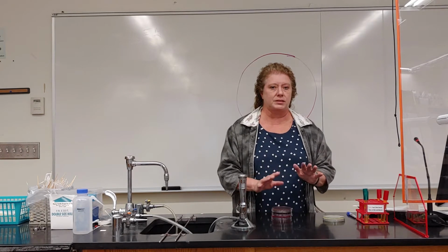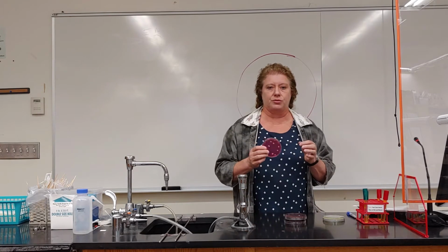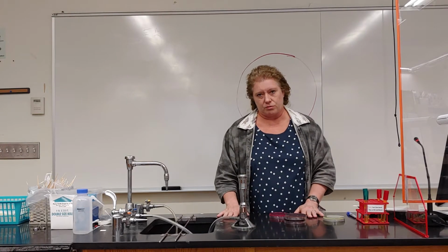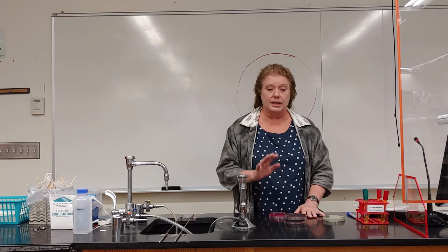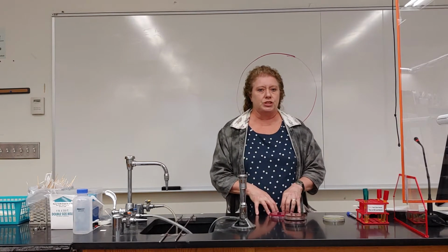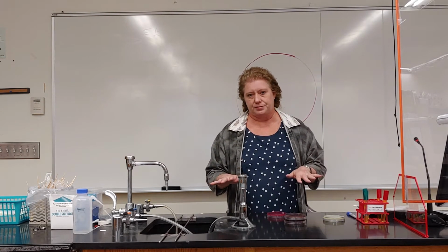That means that on top of a selective ingredient, for instance, in MSA, the selective ingredient is NaCl, salt, that ingredient will either allow the bacteria to grow or not grow, and that will tell us something. And on top of that, if the bacteria grows, and only if it grows, the differential ingredient, which in this case is phenol red, will allow you to tell more about that particular bacteria.